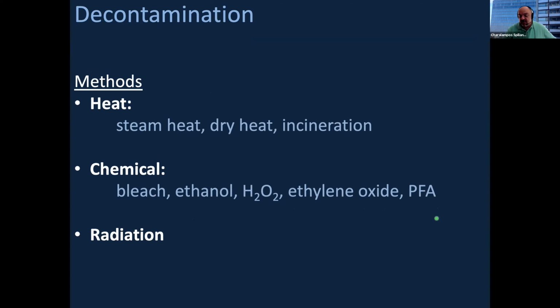So the methods that are applied for these different ways of decontamination are heat. We do use heat in the autoclaves, and that's the way we dispose of stuff from the tissue culture rooms, for example, because steam heat and the increased pressure will destroy even spores, if these spores exist, let's say, in contaminated or disposed equipment.